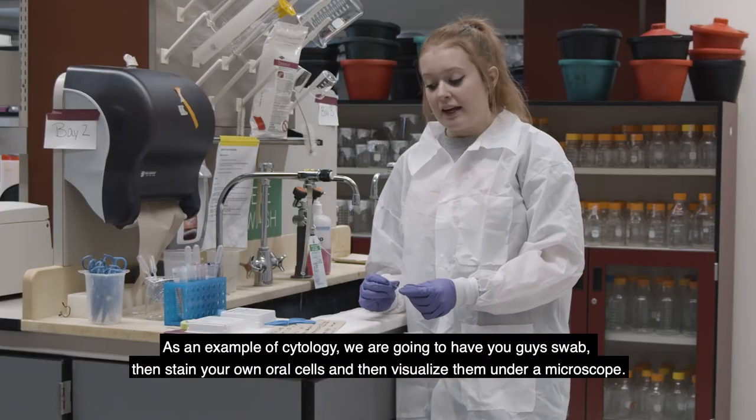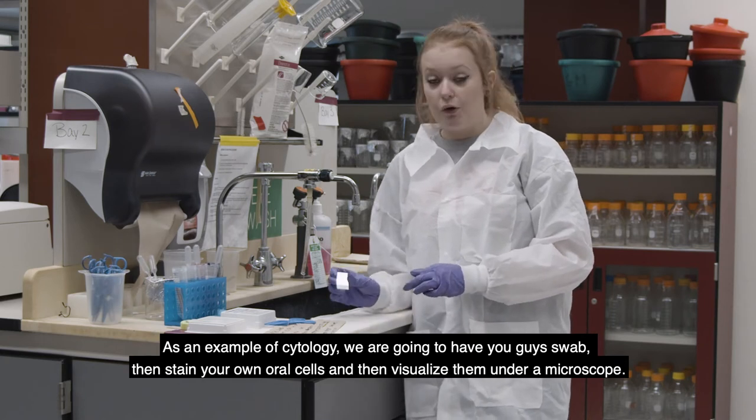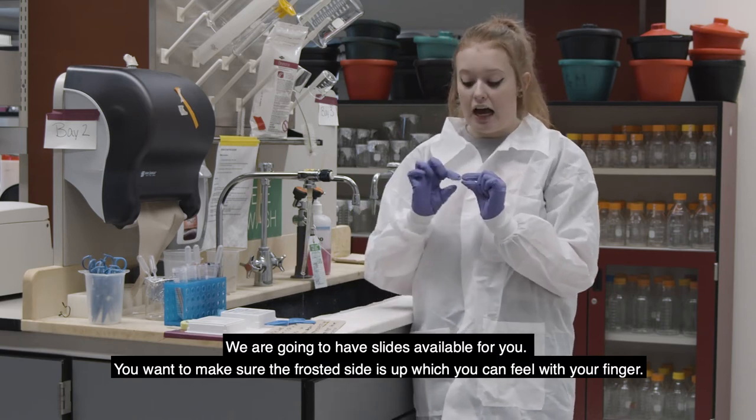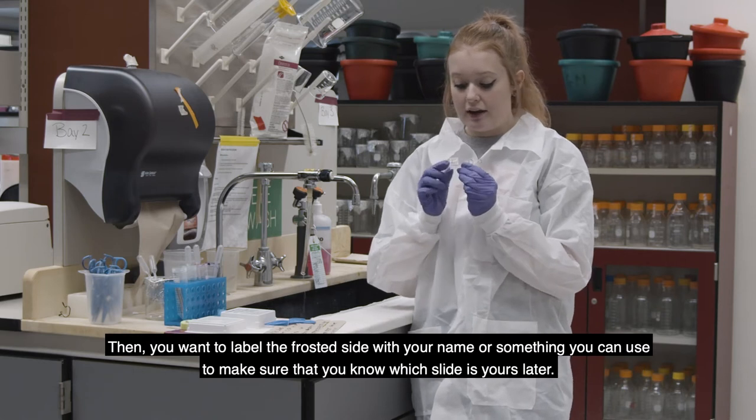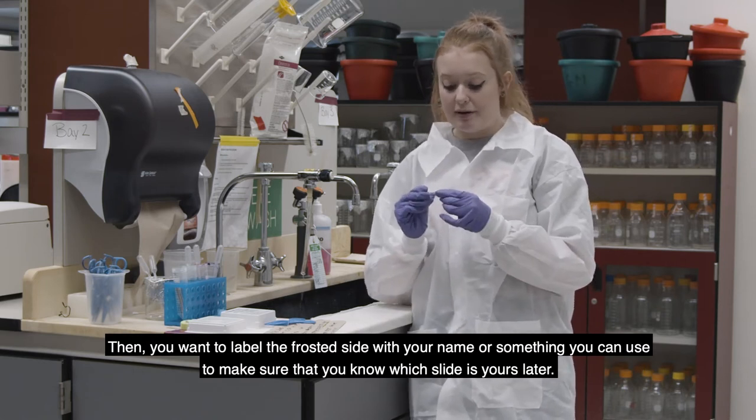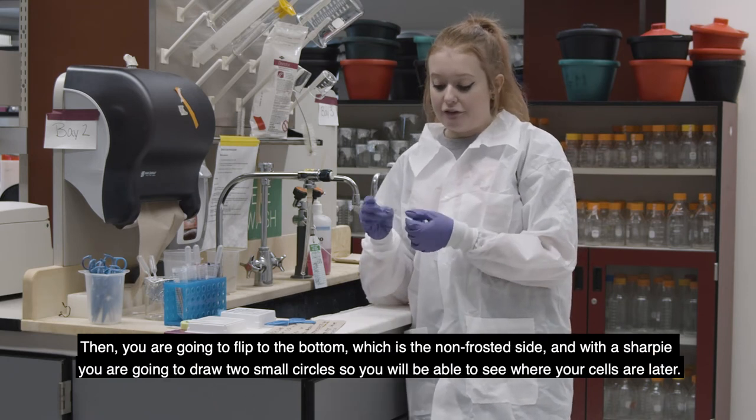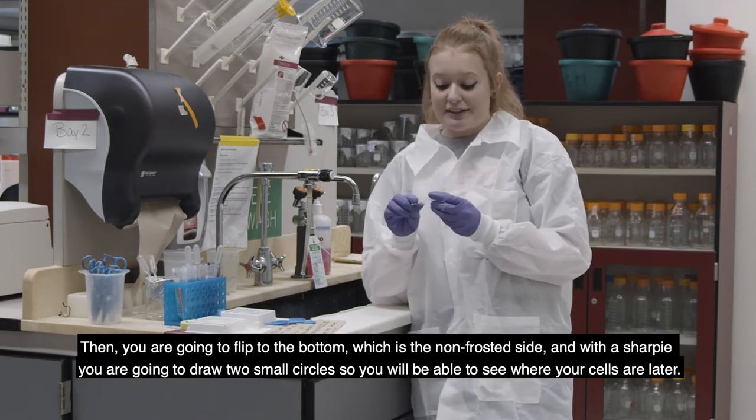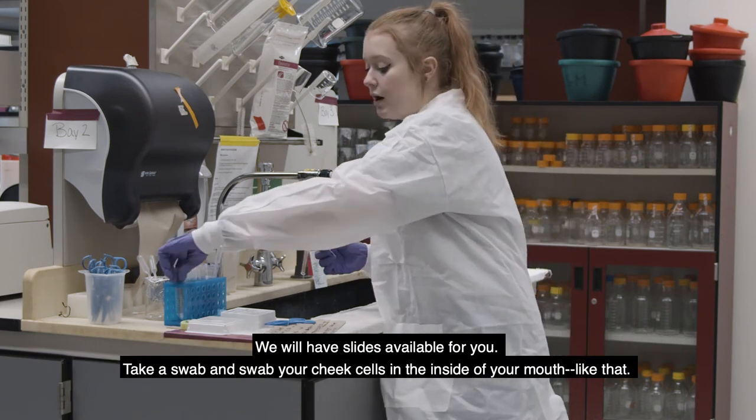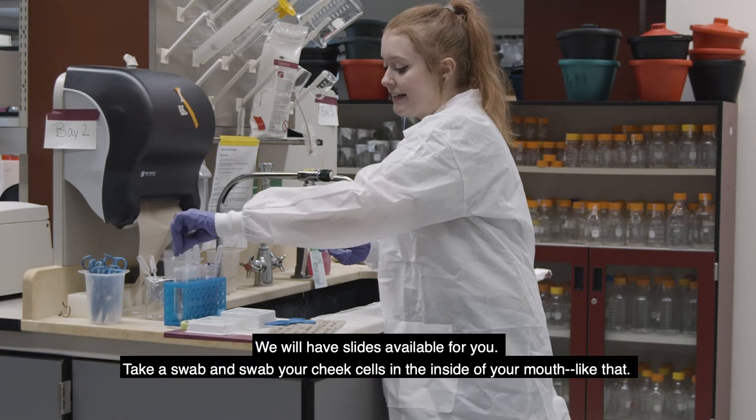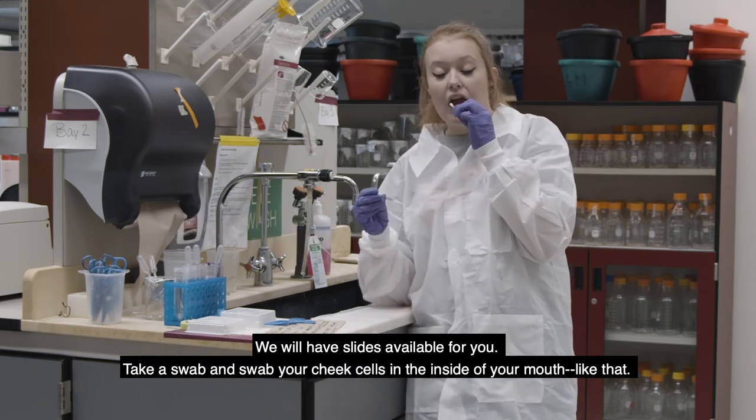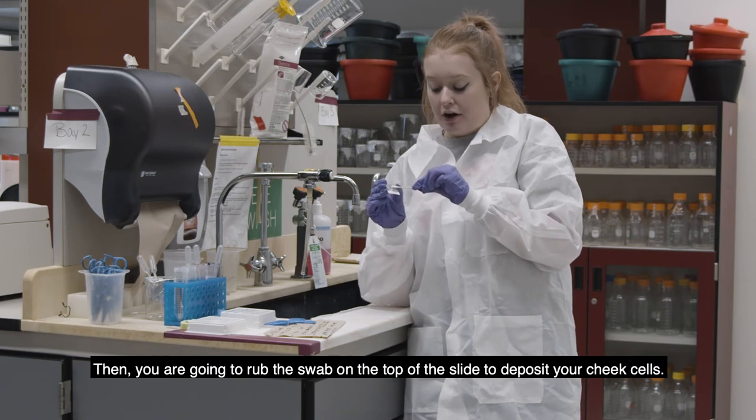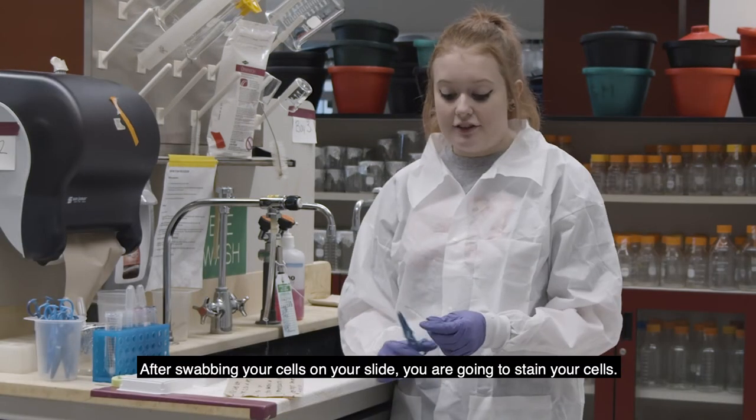As an example of cytology, we're going to have you guys swab and then stain your own oral cells and then visualize them on the microscope. So we're going to have slides available for you. So you want to make sure the frosted side is up, which you can just kind of feel with your finger. And then you want to label the frosted part with your name or something that you can use to make sure that you know which slide is yours later. And then you're going to flip to the bottom, which is the non-frosted slide. And with a sharpie, you're just going to draw two small circles so you'll be able to see where your cells are later. And then we will have swabs available for you. And then you're just going to take the swab and then swab your cheek cells in the inside of your mouth like that. And then you're just going to rub the swab on the top of the slide to deposit your cheek cells.